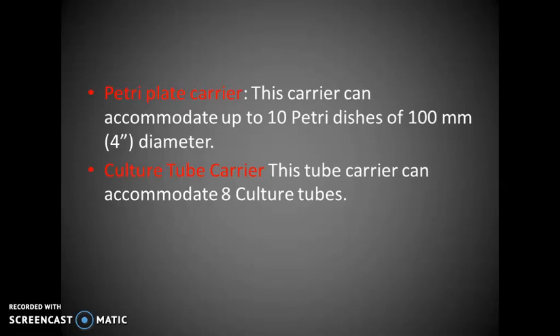Next is the Petri plate carrier. This carrier can accommodate up to 10 Petri dishes of 100 mm diameter. Next are the culture tube carriers. This tube carrier can accommodate 8 culture tubes.